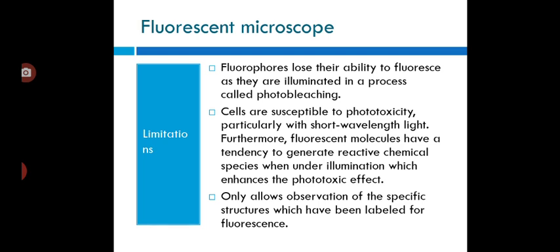Unlike transmitted and reflected light microscopy techniques, fluorescent microscopy only allows observation of the specific structures which have been labeled for fluorescence. So this is the application, advantages and limitations of the fluorescent microscope.